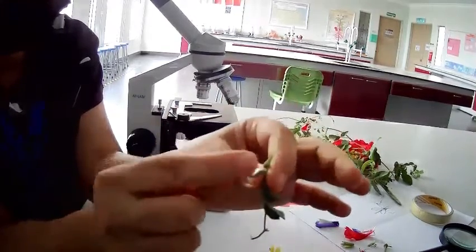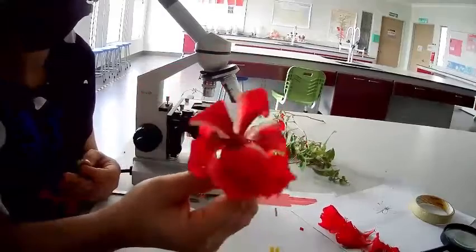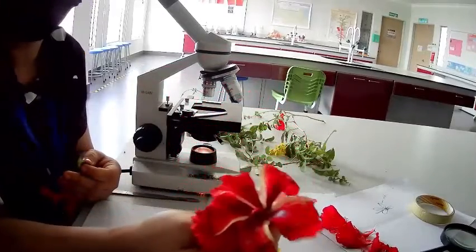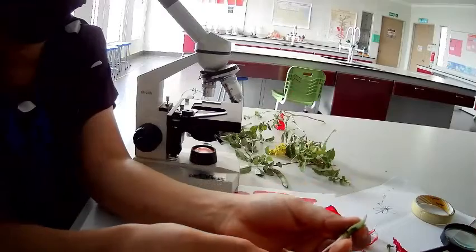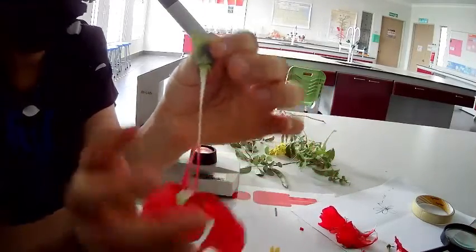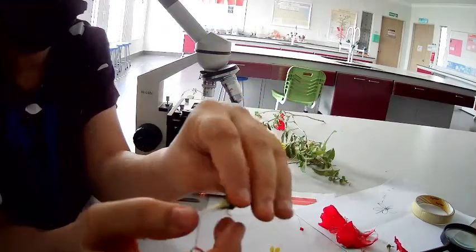So I just want to show this structure now for you under the microscope. I got one more of the grand flower. So I want to show you the female and male part of this one. So reversing again, we remove the petals. But we have to make sure that we do not damage the male and female. I just find the female by first removing the petals, and then I find the ovary.